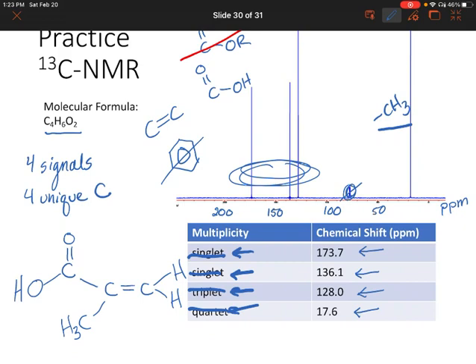So on a test, for instance, if you were stuck between two compounds, but there wasn't really a good way to tell which one it was exactly, you can just write one of them, and as long as you have reasonable functional groups and a reasonable structure, I'll give you full credit for that.